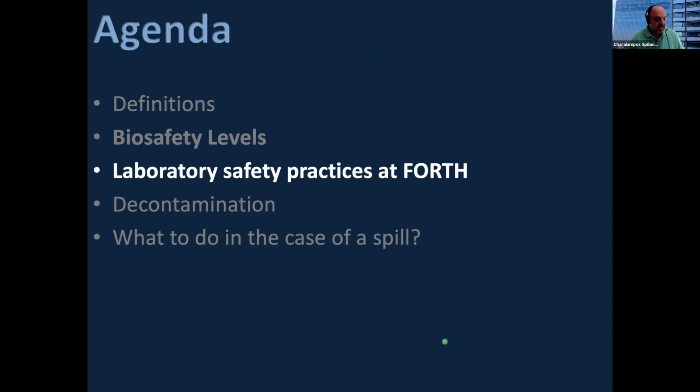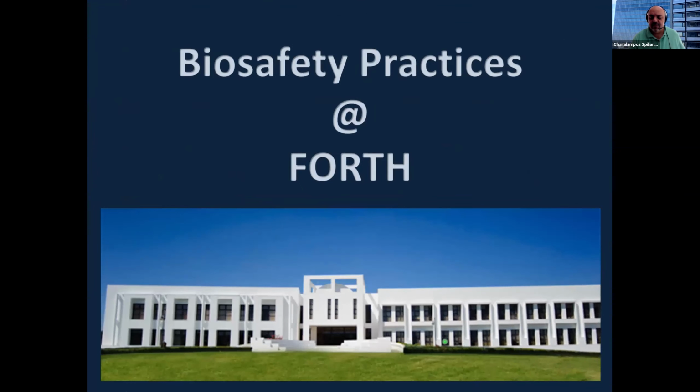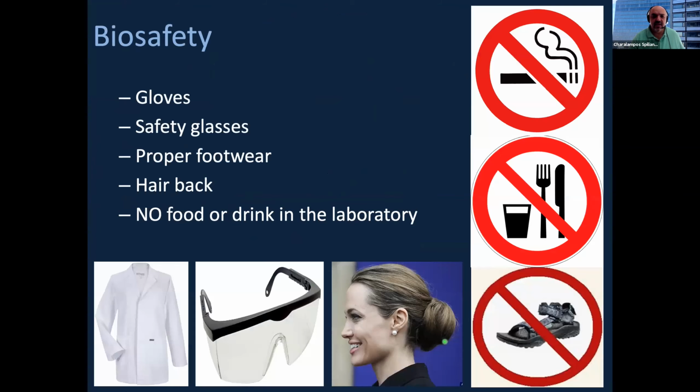More specifically regarding the safety practices, simple things you can do in order to protect yourself, others, and the environment when you work with biohazardous materials. So as we earlier said, it goes without saying, wear gloves, depending on the experiment, and most of them actually do need you to wear gloves.